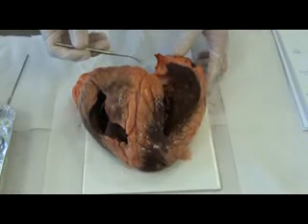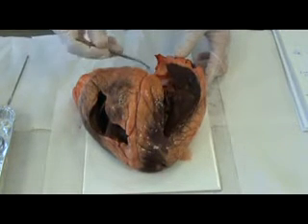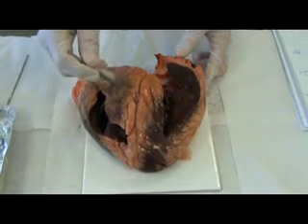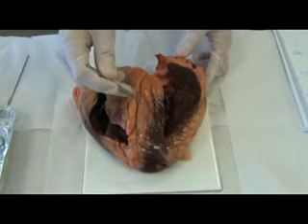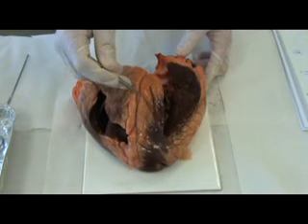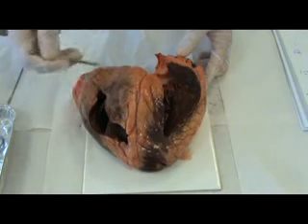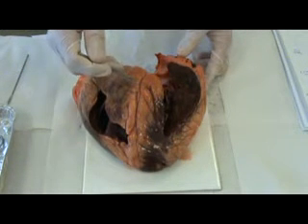Let's look at the blood vessels on the surface of the heart. This is a branch of the great vein running down the surface of the heart. Here we have some of the coronaries. And these coronaries would be the anterior, so the front view, the anterior interventricular branch.